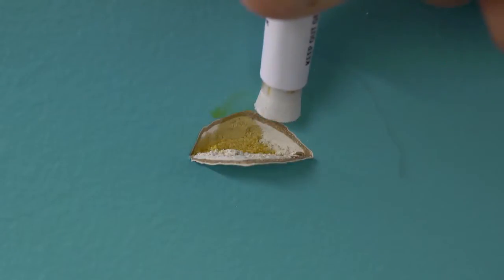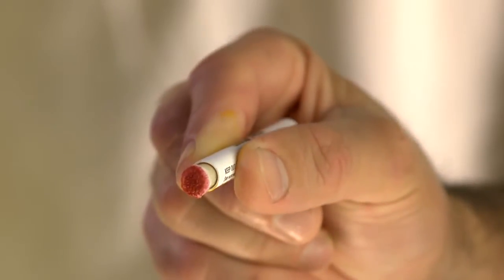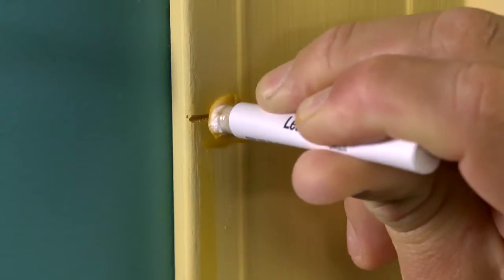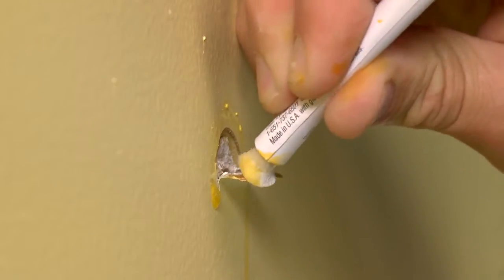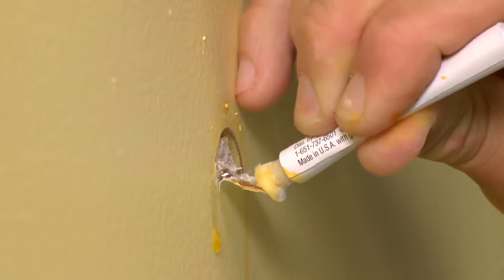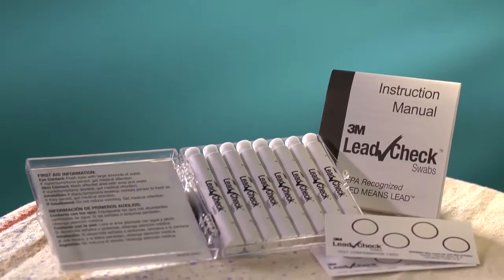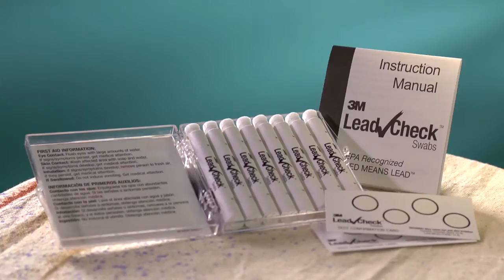This test method is for testing surfaces for the presence of lead. The test method is different for testing wood or testing plaster and drywall. Please use the test method described for each surface type. The methods are described in detail in the instructions that are in your kit.